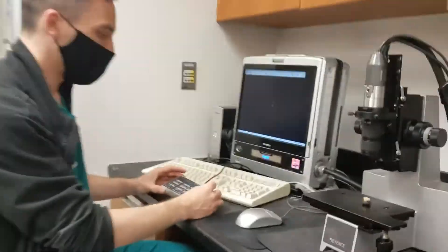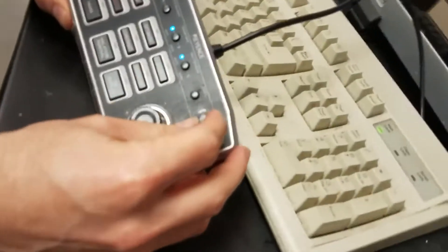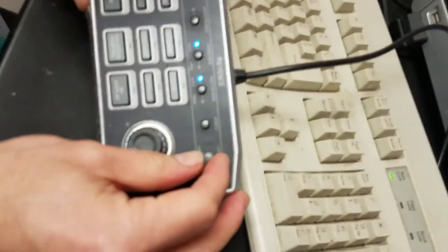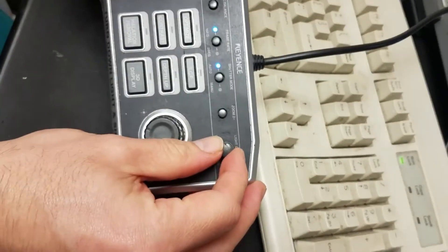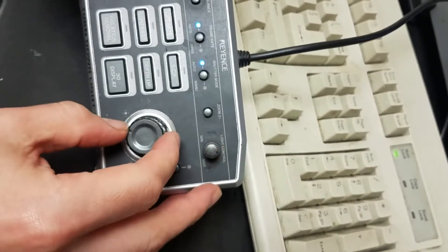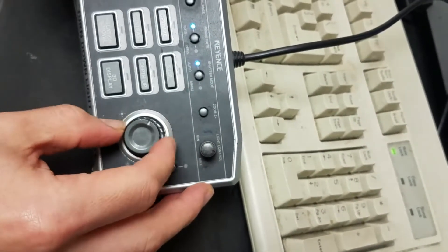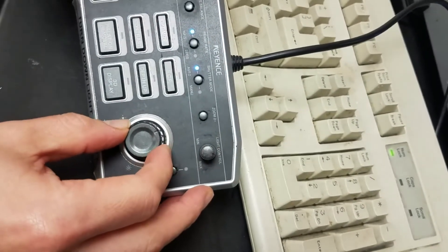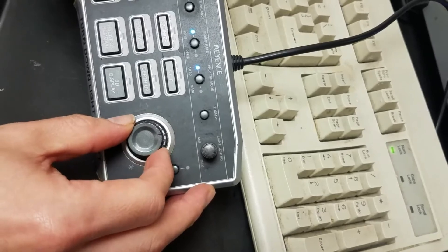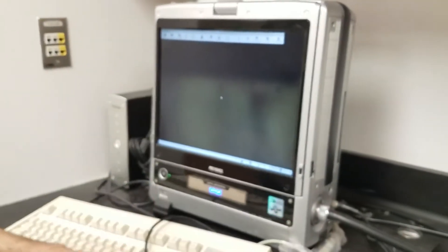To turn the light on, there's a little light control knob right here. And that will start to turn on the light. And then you open up the shutter here. And so as you'll start to see now on the screen, you can start to see that there's objects in there. But they're not in focus.